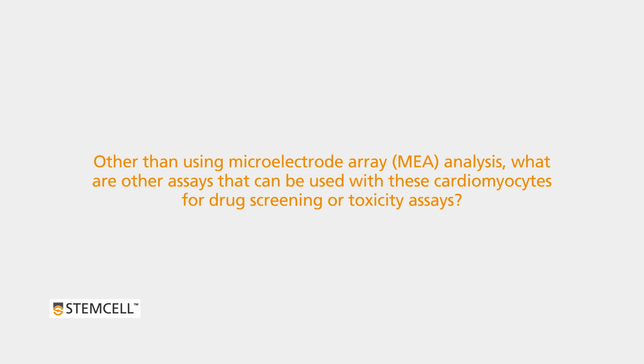So here's a reconstitution of a monolayer, looking at monolayers of cardiomyocytes. One can do single cell electrophysiology using these cardiomyocytes. We haven't shown it here, but you could do patch clamp electrophysiology to look at single cell action potentials, or you could use optical mapping techniques. You can look at calcium imaging as well to look at how an individual cardiomyocyte looks.